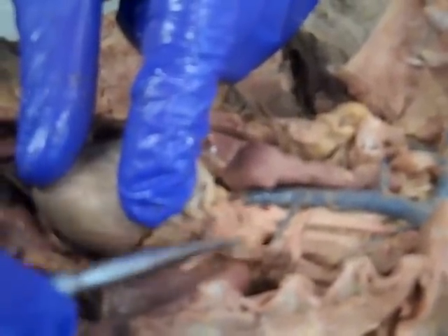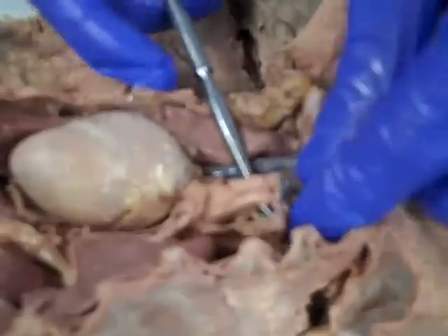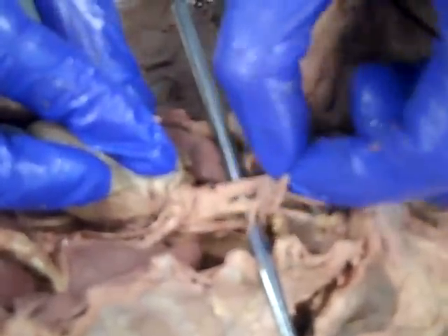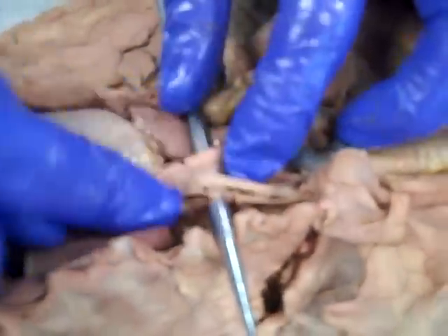Right behind the pulmonary trunk, still kind of buried, we got our aortic arch right here. Still got a little bit of connective tissue on it. But there's our aortic arch right there. And coming off the aortic arch, we can see two arteries right there. Two arteries. Let me get rid of some of this junk in here. But I got two arteries right there, as I dissect while we're filming.